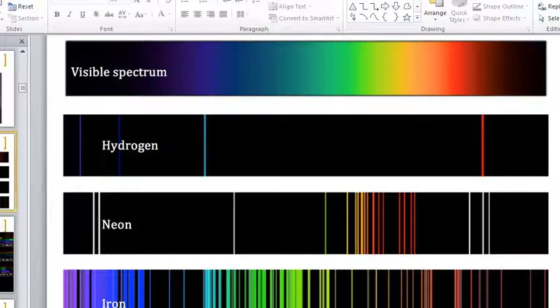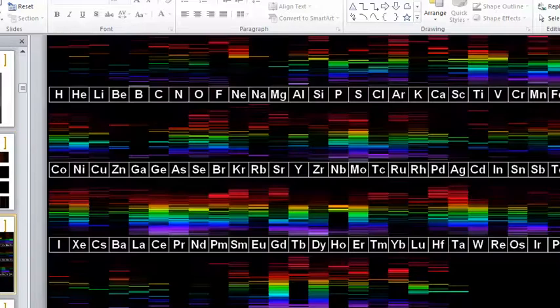So now you're probably questioning, well, why? Why can't I use primary every single time? Why would I have to go to the second best wavelength or the third best wavelength? Well, remember this slide. Tons of lines for every single metal. That means tons of wavelengths that I can choose from for each one of those metals.